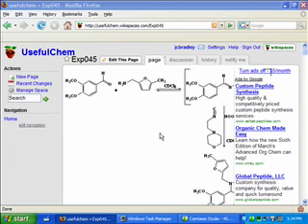So in this particular instance, we've seen movement of 0.02 to 0.03 ppm. And again, making sure that all spectra are properly zeroed, we can see that those shifts are real.